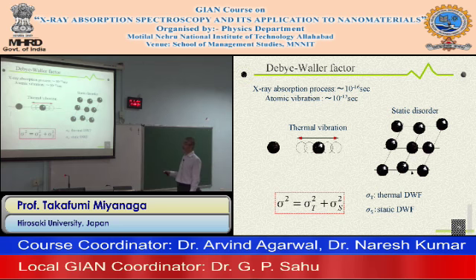So these two disorders, thermal disorder or thermal vibration and static disorder, are included in the Debye-Waller factors. But they can be distinguished. So when we measure the temperature dependence of EXAFS, only the thermal vibration is effective.